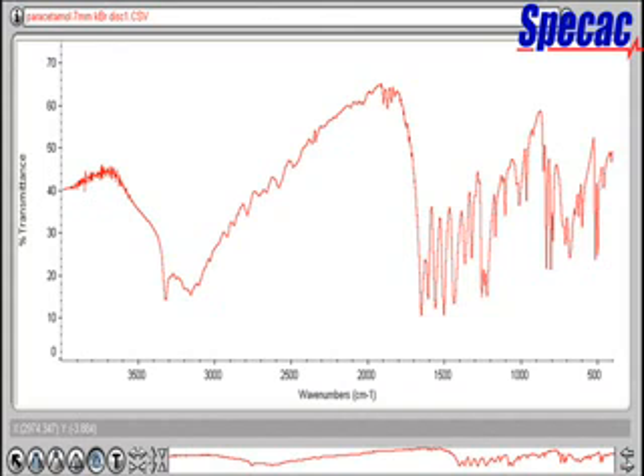A typical IR spectrum is shown for the paracetamol sample prepared as this 7mm diameter KBR pellet.